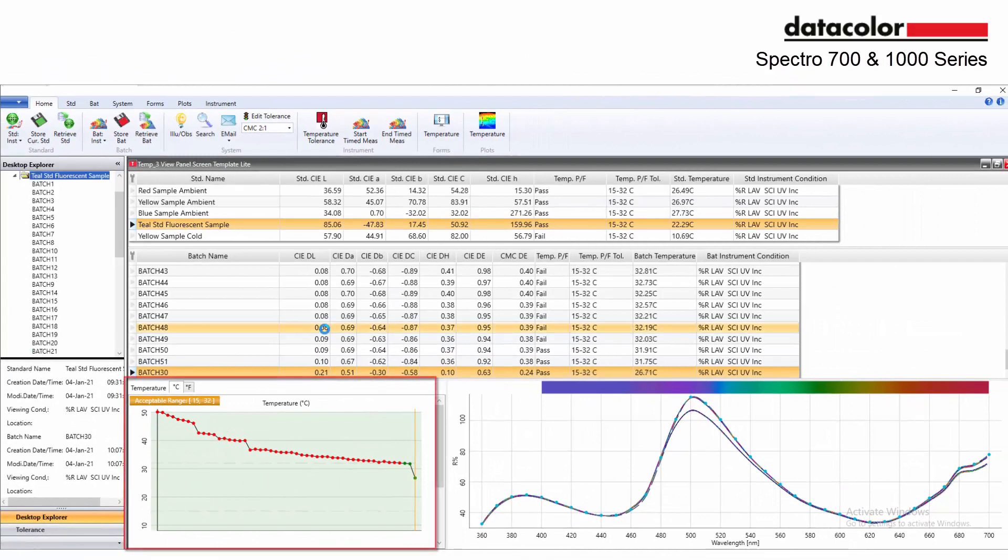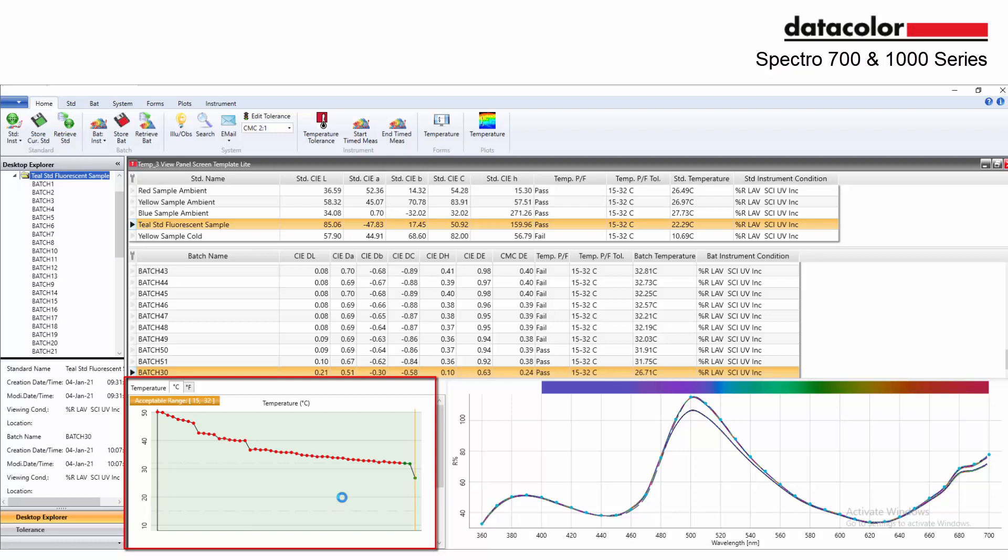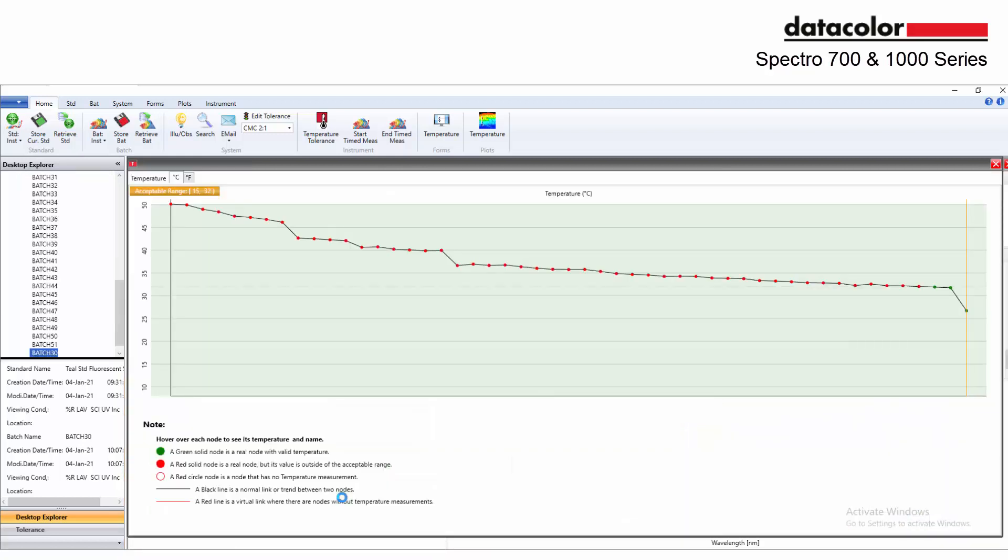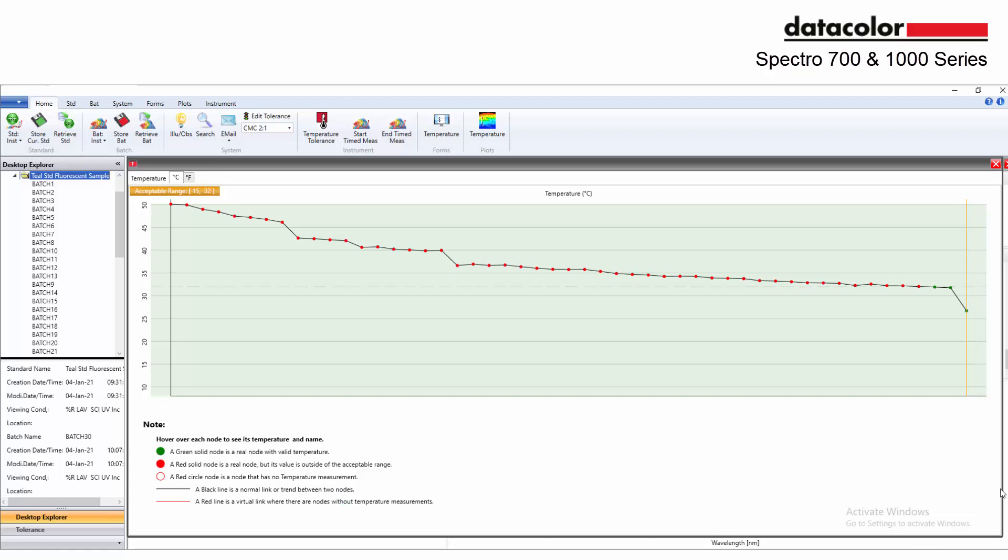A new trend plot has been added which allows the user the ability to evaluate the sample temperature of each measurement over time. This is particularly useful for the fabrication process of materials with thermochromic pigments that change color with temperature.